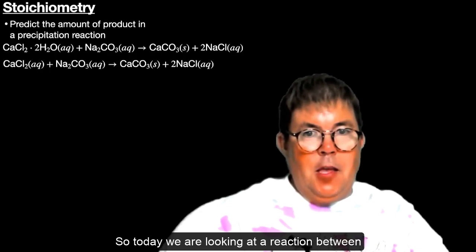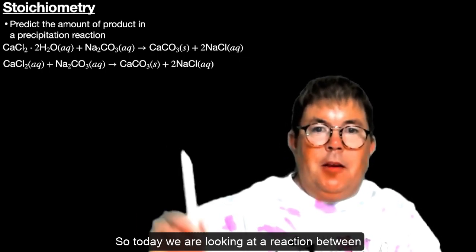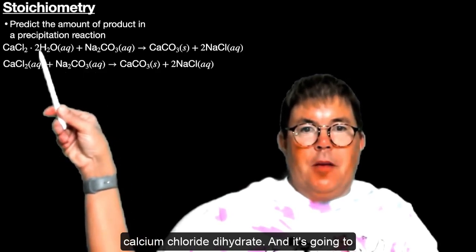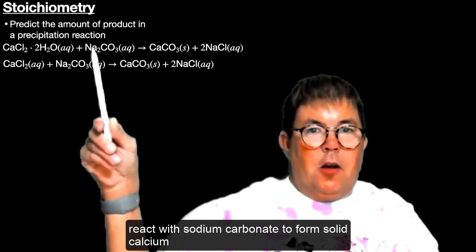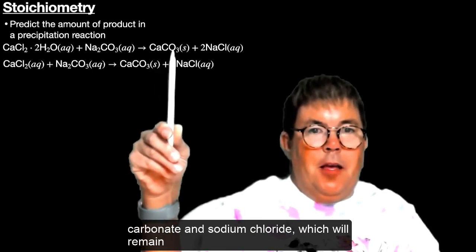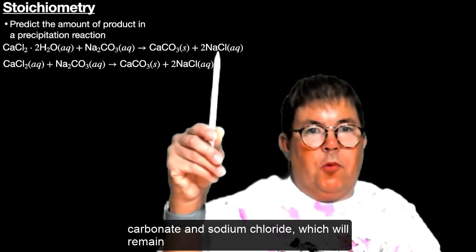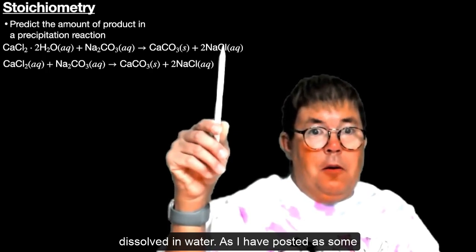So today we are looking at a reaction between calcium chloride dihydrate, and it's going to react with sodium carbonate to form solid calcium carbonate and sodium chloride, which will remain dissolved in water.